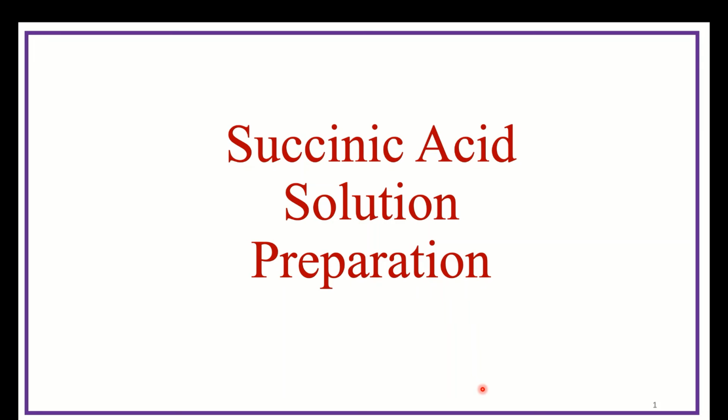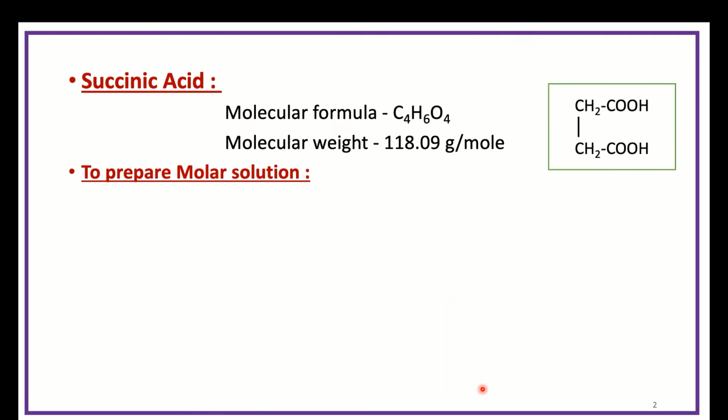Hello everyone. Today let us take the preparation of succinic acid solution. In the laboratory, we use succinic acid as a primary standard to standardize the basic or NaOH solution generally.